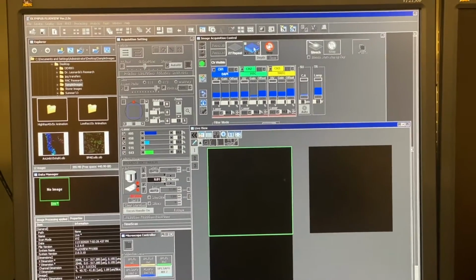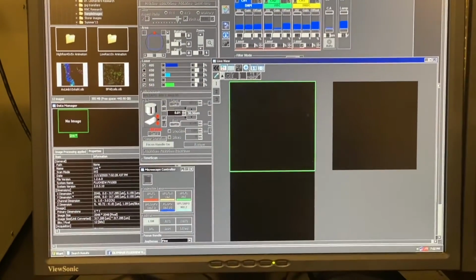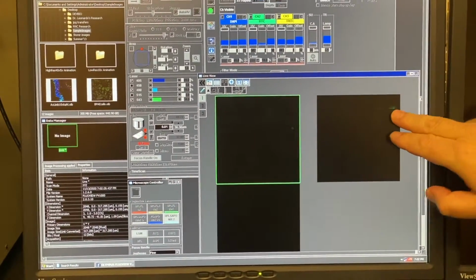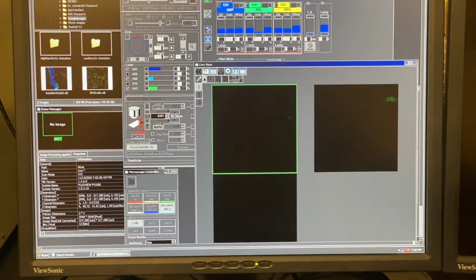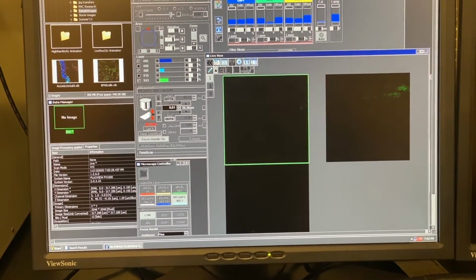So I just press this XYZ, it goes to the very top, which we said was 40 microns up from the microscope slide. And it starts to scan it, and it's seeing some green, but remember how little blue there was at the very top, right? Because those cells got cut by the knife, and their nucleus fell out.